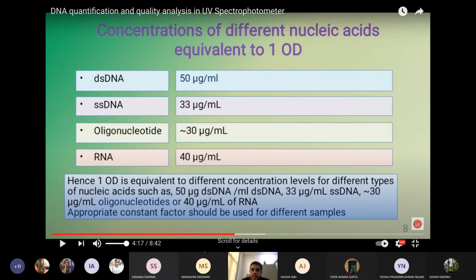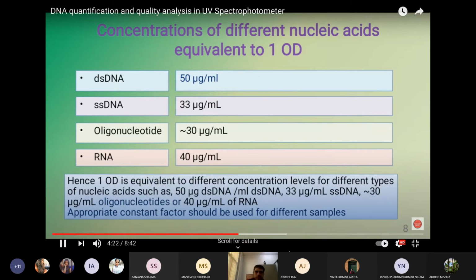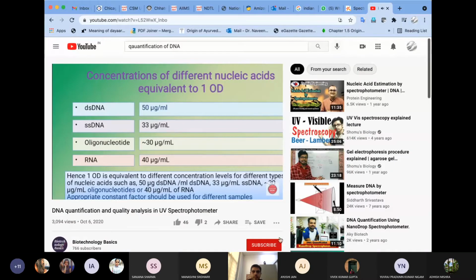Oligonucleotides are going to be single stranded DNA, but small DNA. For them it is going to be 30, and RNA is going to be 40 microgram per ml. Concentration will absorb one optical density value. 33 microgram per ml of single stranded DNA will absorb one OD value of light, and oligonucleotides absorb in the range of one OD equal to 30 microgram per ml. Similarly, RNA will absorb 40 microgram per ml for one OD.